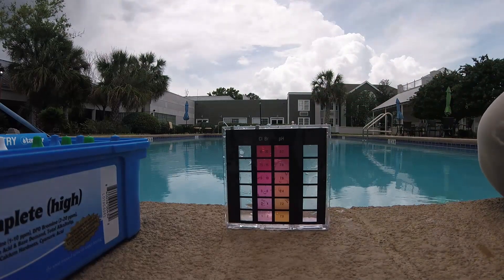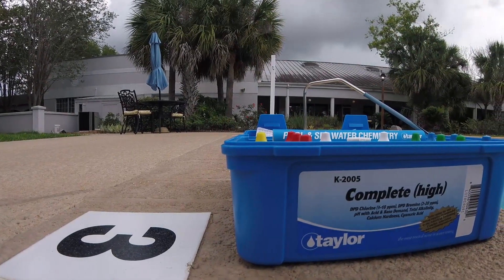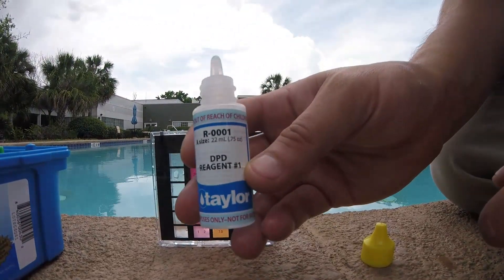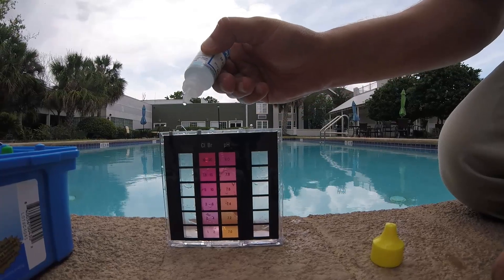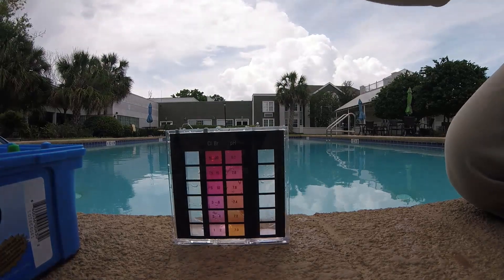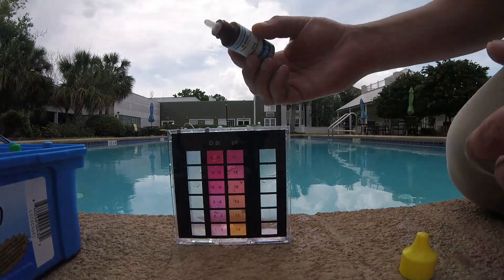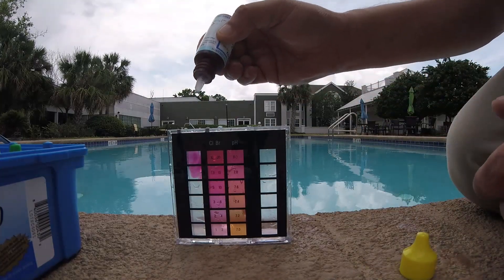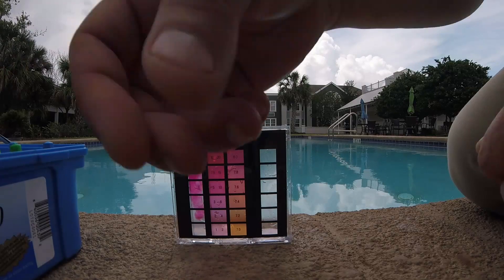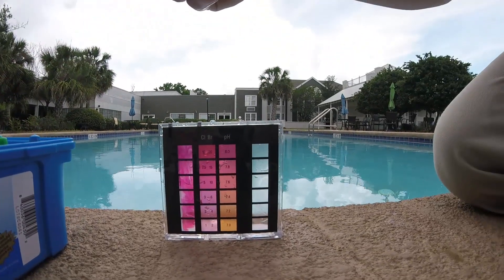We'll fill up the vials with water. Usually use the R1 — five drops: one, two, three, four, five. And use the brown bottle which is the R2, and five drops of that: one, two, three, four, five. It turns purple. Now I'm doing pH two, so what I need to do is grab my pH indicator and five drops of this: one, two, three, four, five.